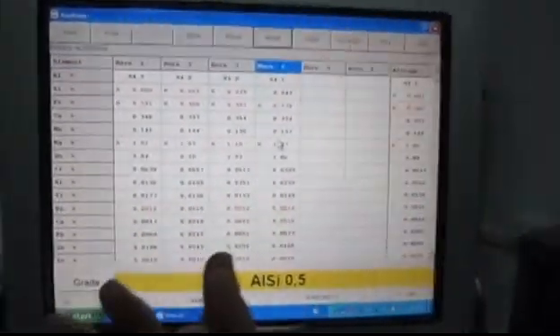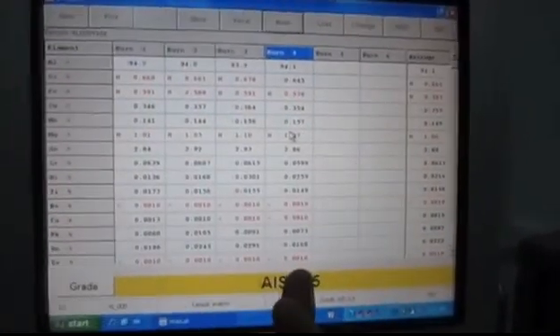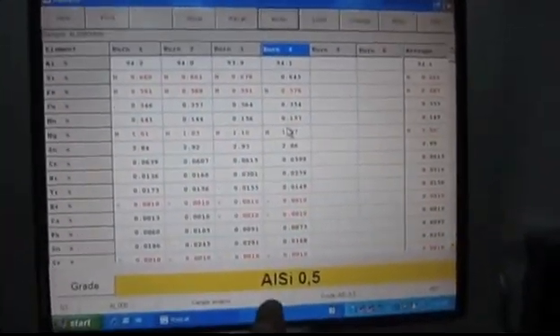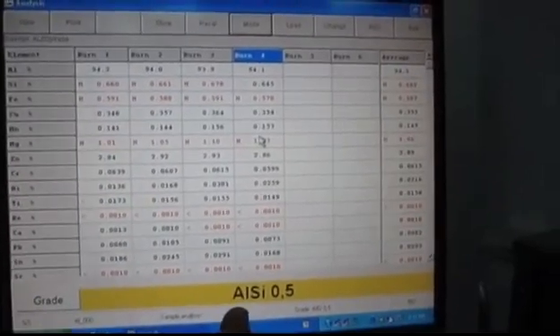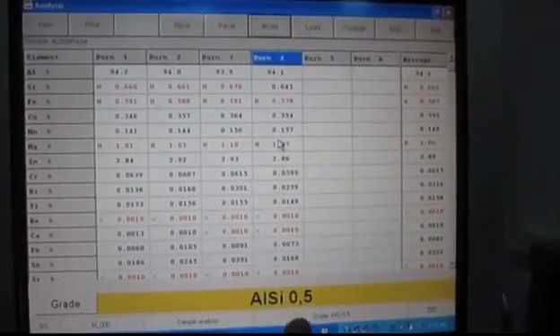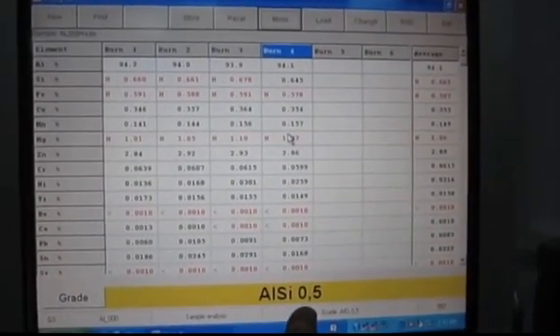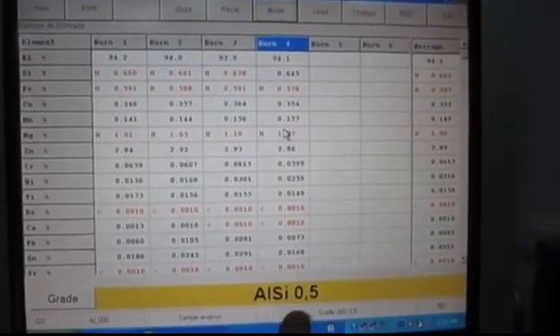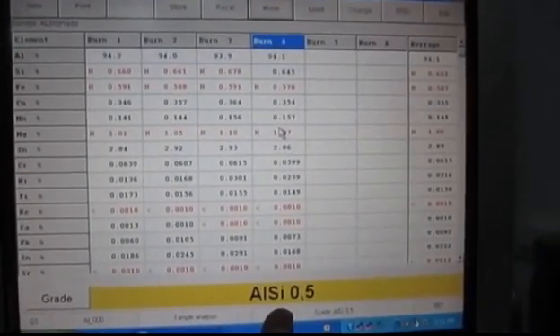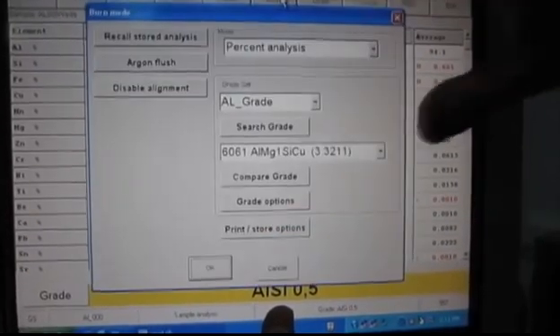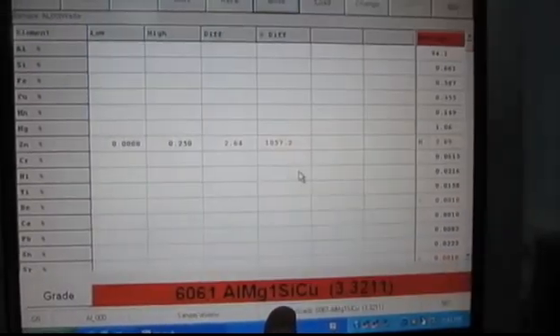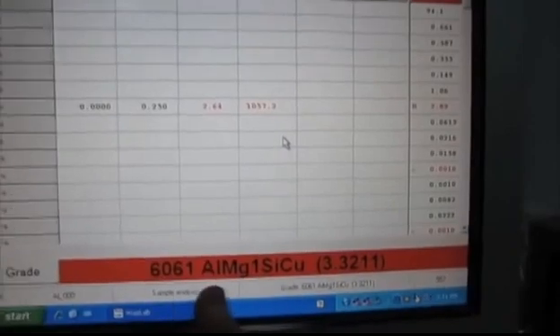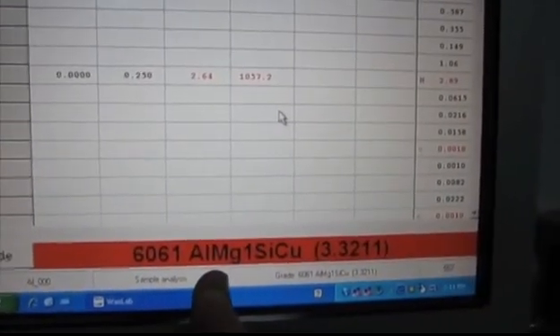We've already done three previous tests, this is the fourth test to get an average. The machine has analysed the metal and it believes it is ALSI 0.5 when it should actually be 6061. So we're actually going to compare it to the 6061 database. Now down the bottom here you've got 6061 in red.